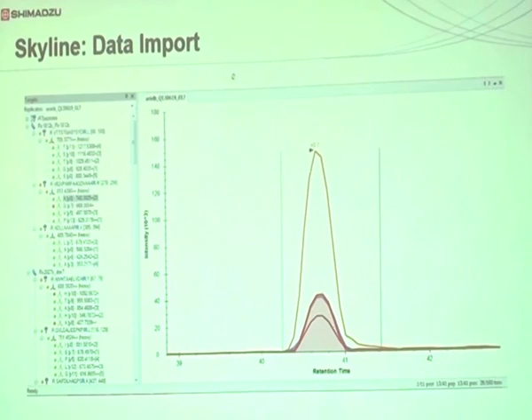So depending upon your selection criteria, you will select which peptides have to be kept for further analysis and which have to be removed. Most of the peptides which are giving you a red color symbol, you will remove them in the filtration, and you will keep only those peptides which are giving a green color symbol. And then those transitions you can use for further analysis. On that method, you will be analyzing all of your samples, and then you can compare the peak areas for all the samples and perform the relative quantification analysis.